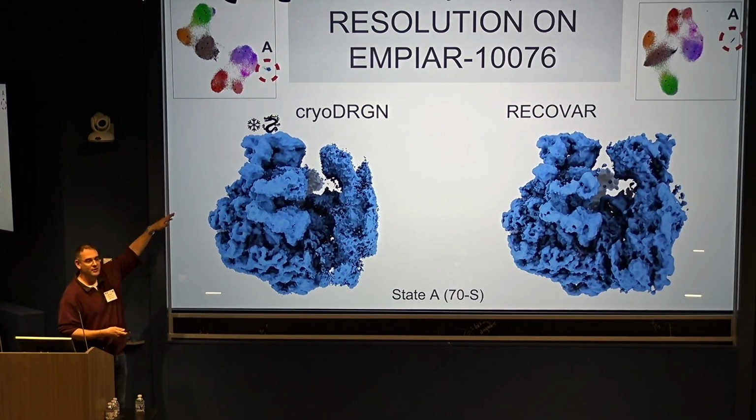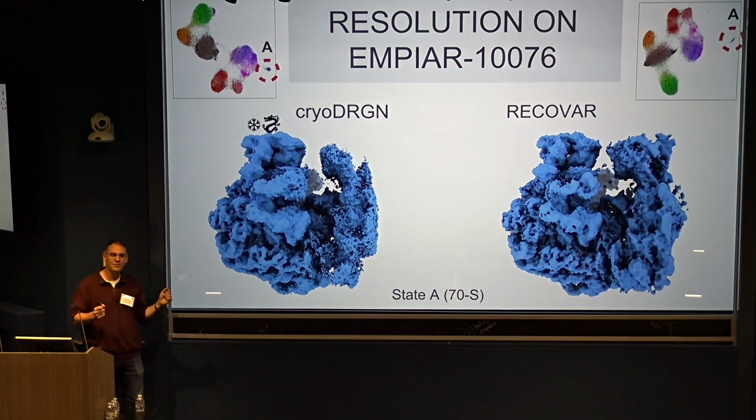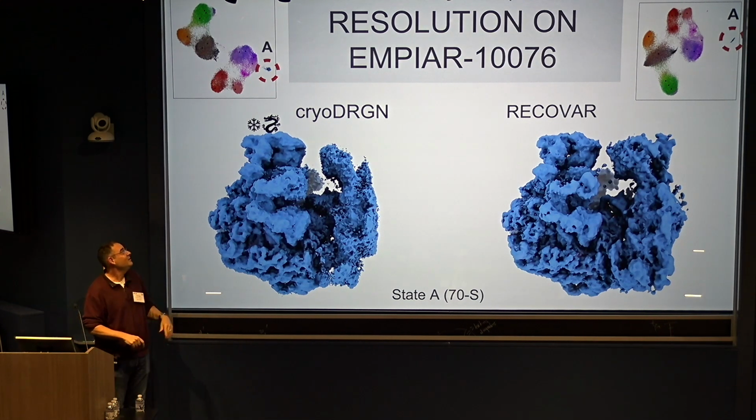These are for actually experimental data. What is good about cryo-EM, unlike maybe other fields in biology, is that people actually share the data after they publish. They publish in Nature, Science, and so on, but after they publish, they are willing to share the data with method developers like ourselves. And EMPIAR is a public repository for electron microscopy data.